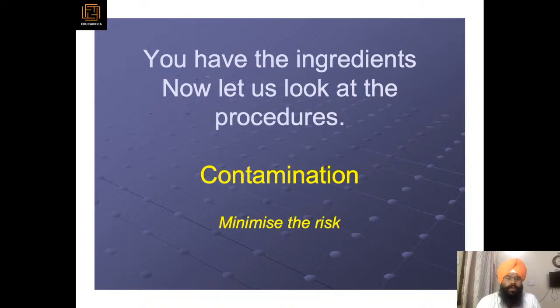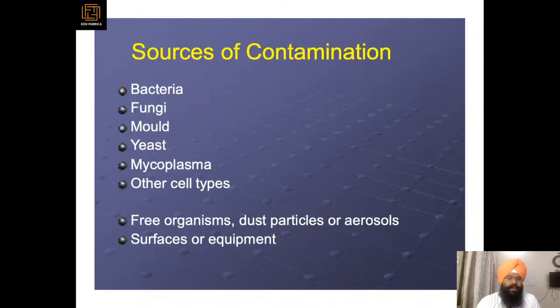So we have the media now, everything is done. Now let's see how to minimize the risk of contamination. Sources of contamination in our cell cultures are bacteria, fungi, mold, yeast, mycoplasma, other cell types, dust particles or aerosols, and surfaces or equipment, which have to be taken care of.